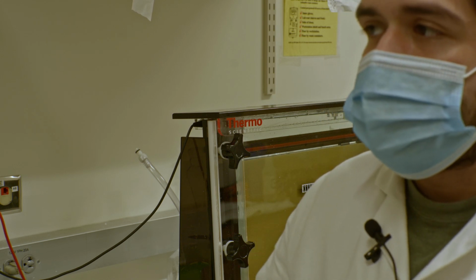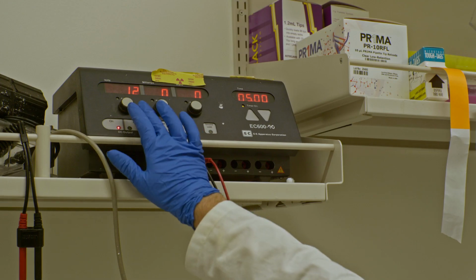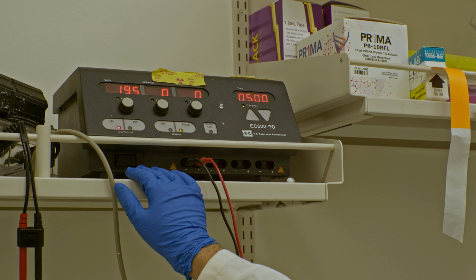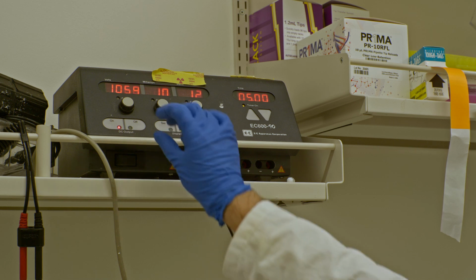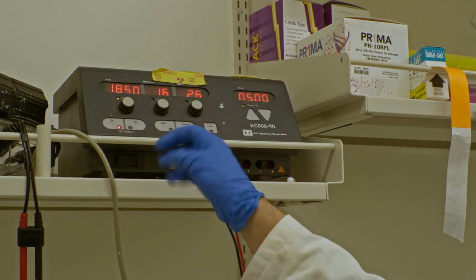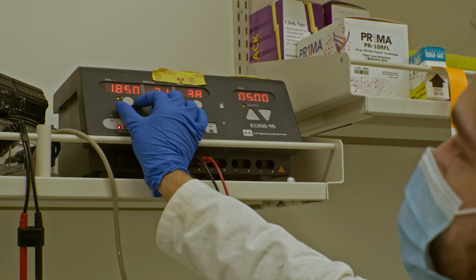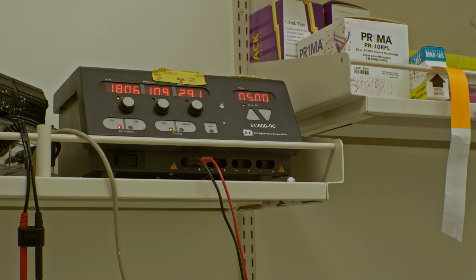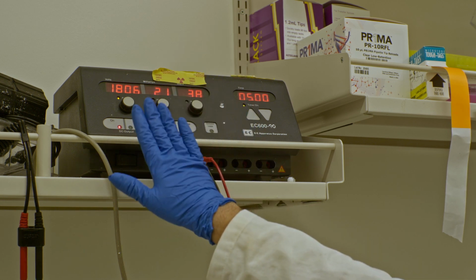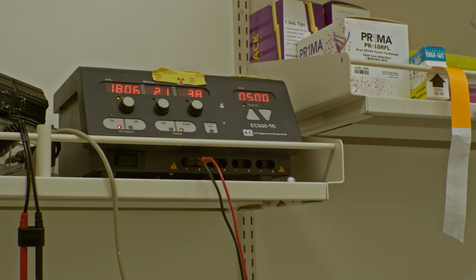So what we want to do is press the on button right here. And as soon as you do that, you can see that the voltage is starting to go up. As soon as it stops, you can then start to change the voltage. If you turn it clockwise, of course, it will increase the voltage. If you turn it counterclockwise, it will decrease the voltage. Right now, it's at 1850. Let's decrease it just a little bit, closer to 1800. And that's good enough. Once you hear those beeping noises, it will only run at the voltage that you set it at. So 1800 volts is probably the maximum amount that you can do for this gel box.